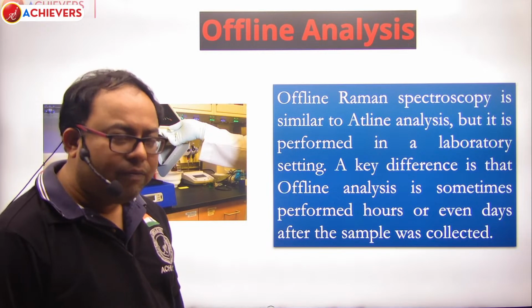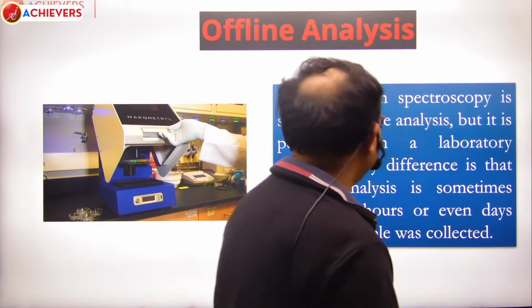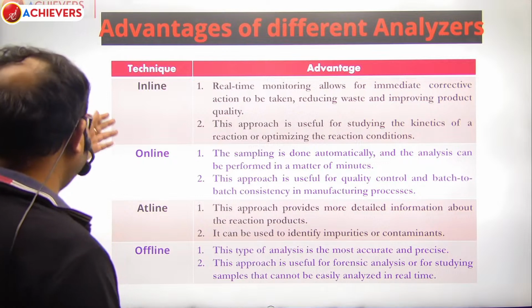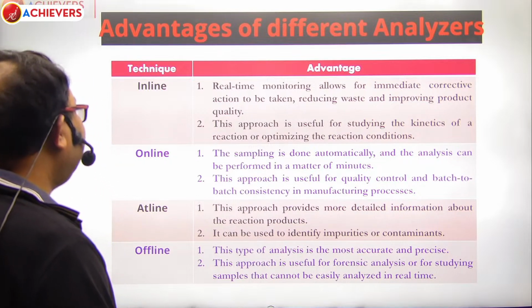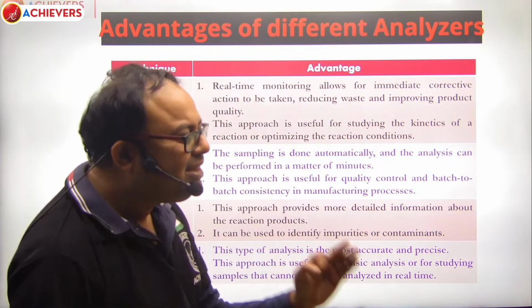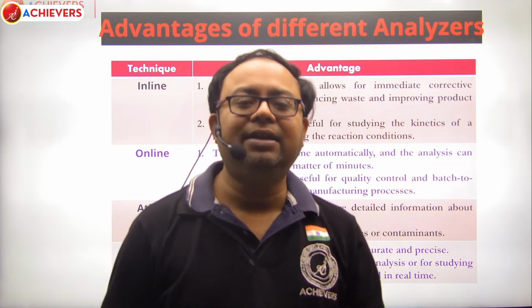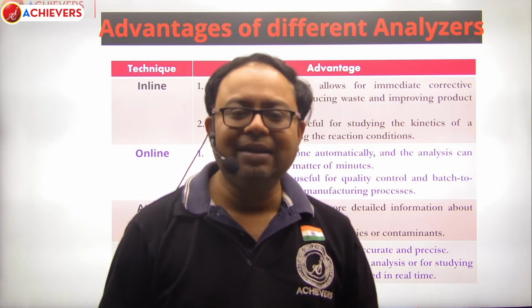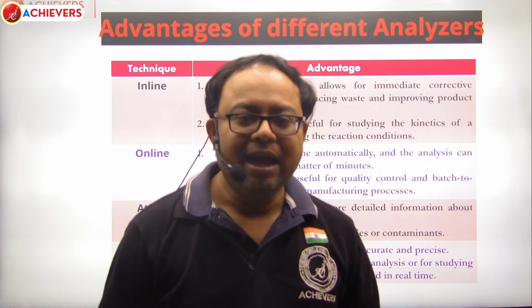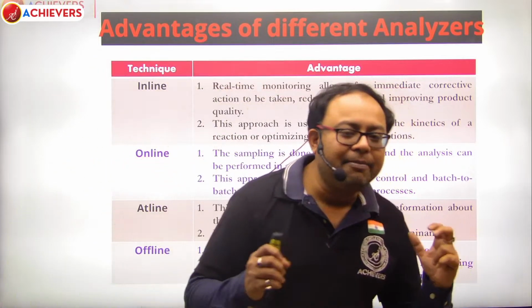So now we'll summarize the advantages of different analyzers. So let's have a look. Advantages of different analyzers. The first one is inline. In inline, you have two advantages. The first one is real-time monitoring. This is the most important advantage of inline or online analysis. It gives you real-time monitoring.